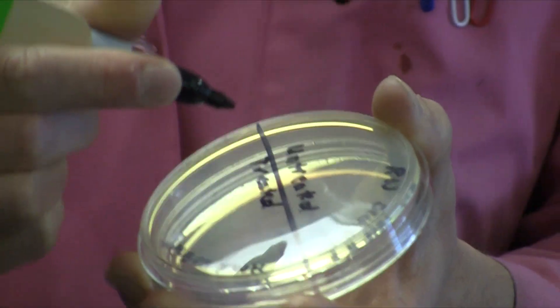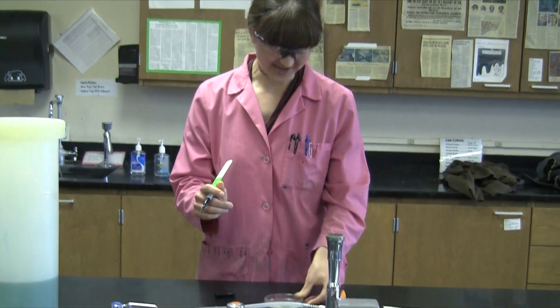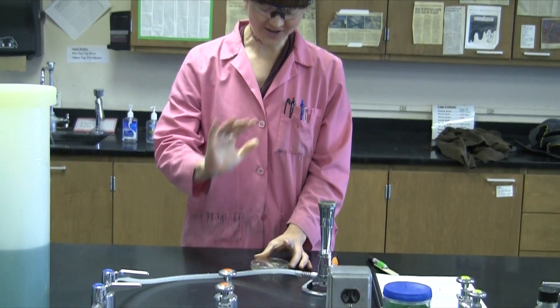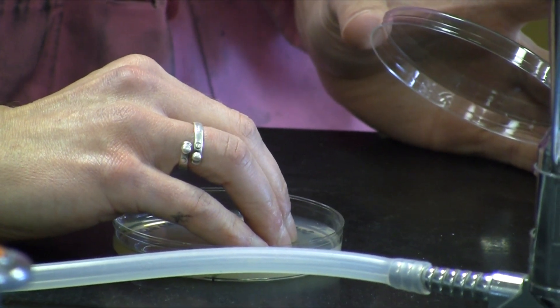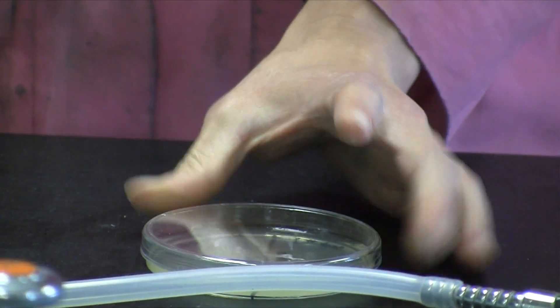You'll begin on the untreated side. You want to make an impression with four fingers, having dirty hands — maybe you've been outside and your hands are pretty nasty. Make a four-fingered impression on the untreated side. You don't have to push very hard; just lightly touch the surface of the agar.